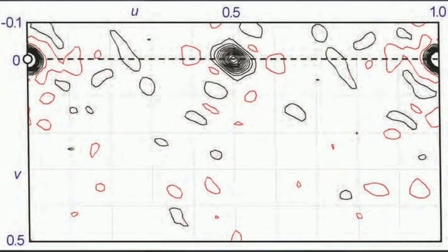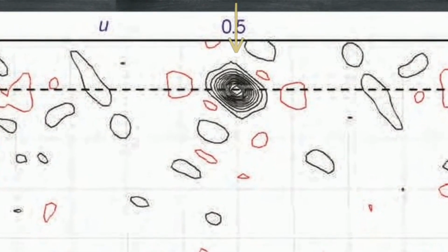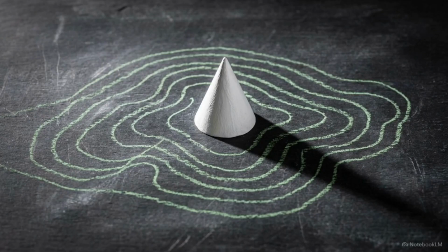The native Patterson map shows the second fingerprint. Because every single atom in the molecular copy is shifted by the exact same distance vector, the superimposed collinear vectors aggregate. This forms a massive superpeak located precisely at the translation distance. When pure translation dictates the symmetry, the unphased Patterson space isolates the exact translation vector, completely bypassing the need for initial phase data.